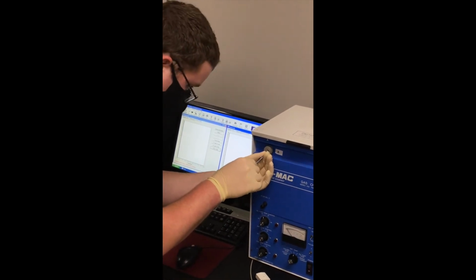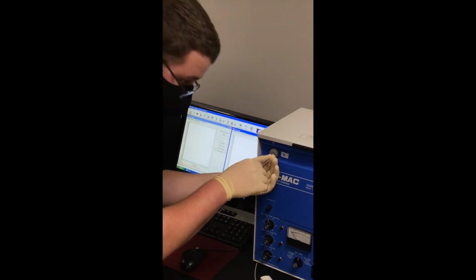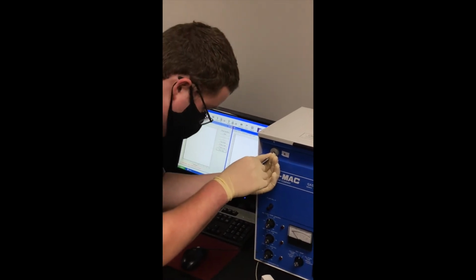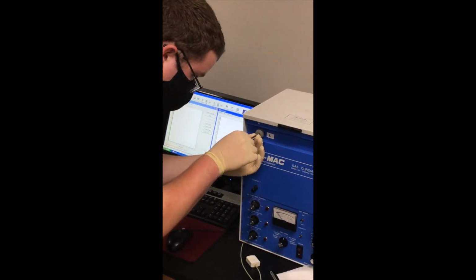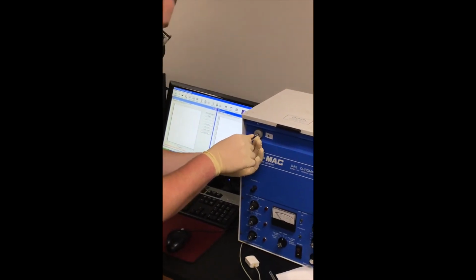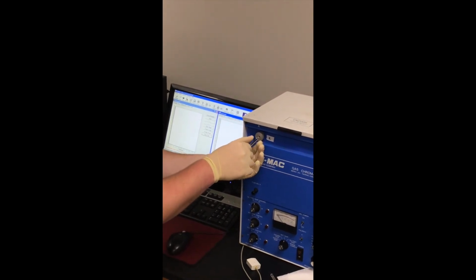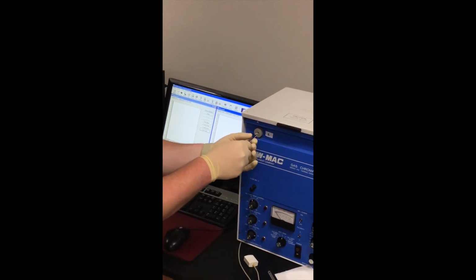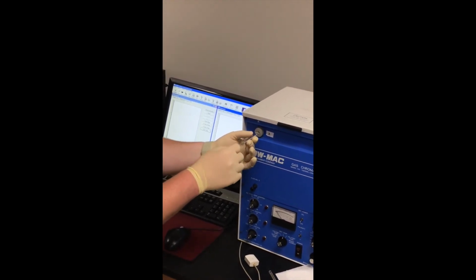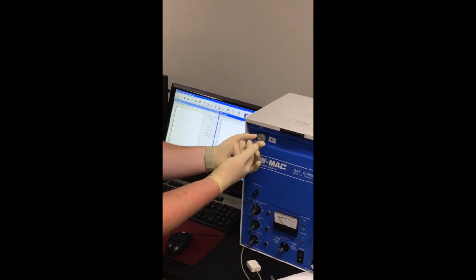Now, when you actually do this yourself, you'll have to do it yourself to understand what I'm saying. But you're going to feel a little bit of resistance at first. That's the rubber septum. You have to push through it. It's going to go through relatively easy. You just push on it until it starts to go through, and then it'll go through easy. Once you get closer to the end of the needle, you're going to feel greater and greater resistance. Then you need to stop. At this point, you're all the way in the GC and you're running into something else. Supposing that this actually had something in it, I would now have it in here and it's ready to go. I just haven't injected it yet.